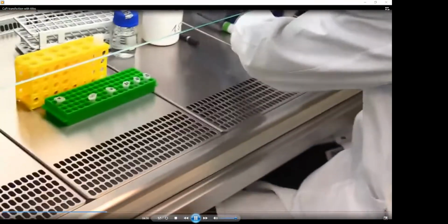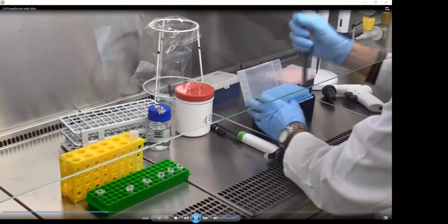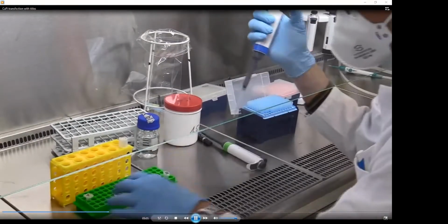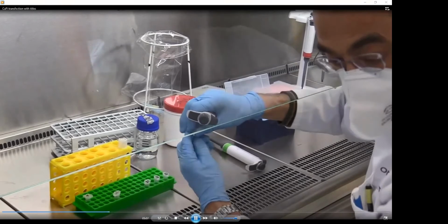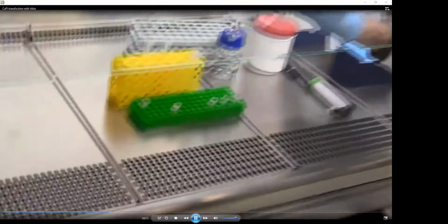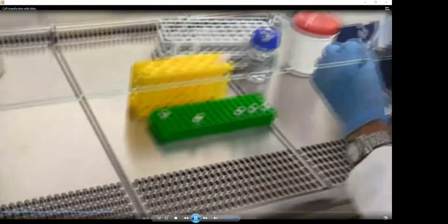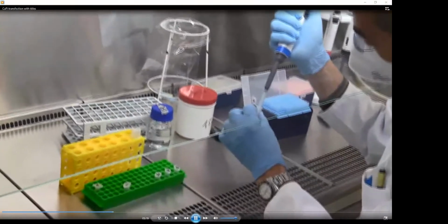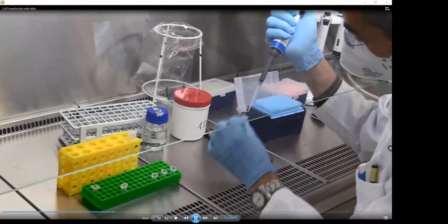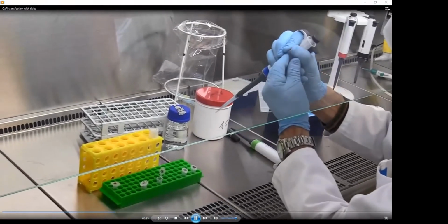So then you take a part from the sample which you have prepared and labeled B, and you put it into this B1. B1 is doubled amount because this will be used also for one sample, which will be stimulated using lithium chloride.